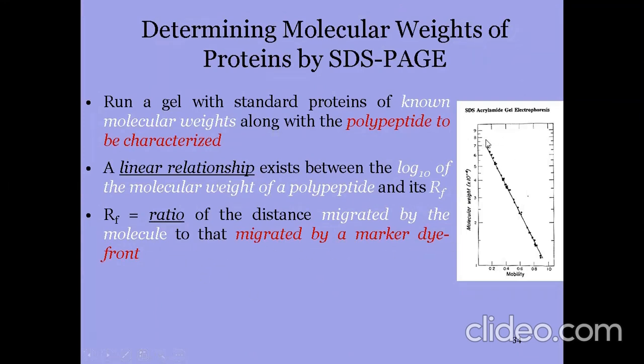dye front. So initially we put dye in the sample, the sample dye, which we add when we want to run a gel.